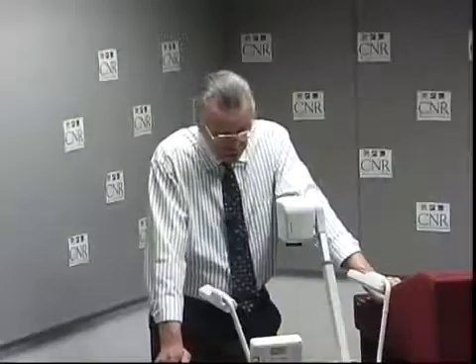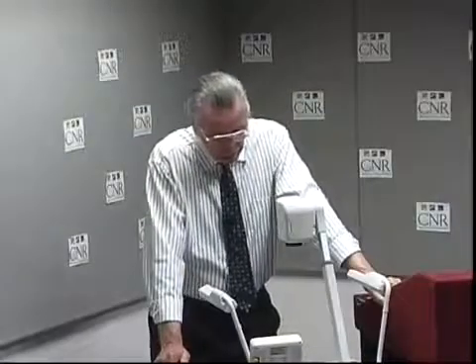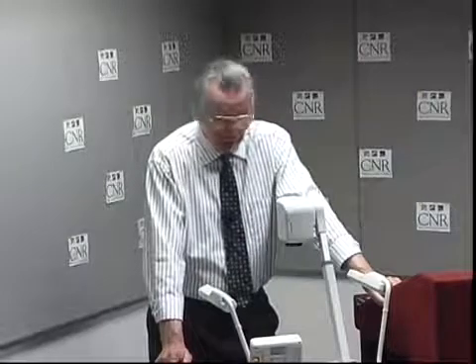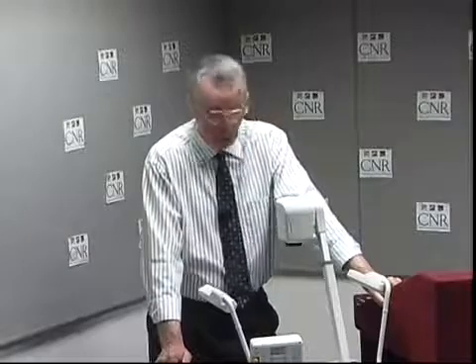Is the stock as received to the quality that you have purchased? So you're not interested in quantifying the light gray things. You want to know how much dirt is there. How much do you have to remove and how much remains? It is a totally different environment than when you ship the stock to a buyer.